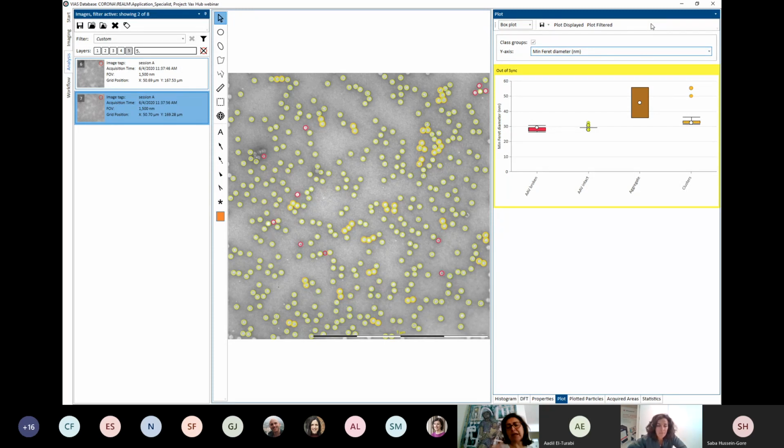Yeah, exactly, because I find that data with the shoulder obviously becomes important. That means that you have to deconvolute it further to get more information. And I just wanted to make sure that with your system, that is something that is doable, so that if we deconvolute this and get to the shoulder, we can relate that shoulder back to the image and say, this is what was on the image, which was then translated to a shoulder. Yeah. Okay. Yeah, absolutely. If you can do that, that would be very useful.